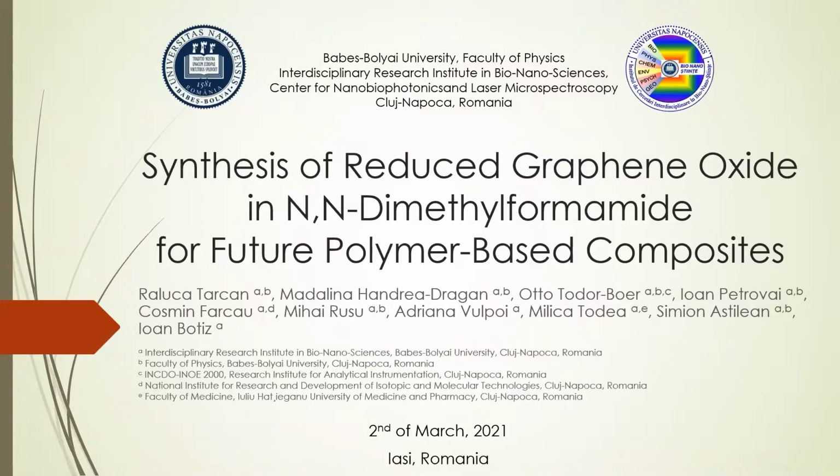Today I'm going to present you a new fast and faster synthesis method for reduced graphene oxide in DMF, which is promising for future polymer-based composites.